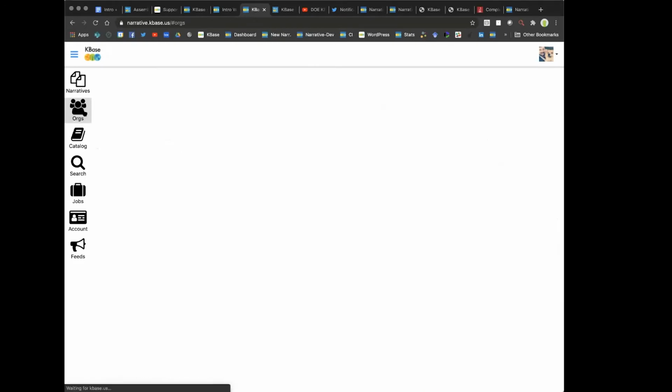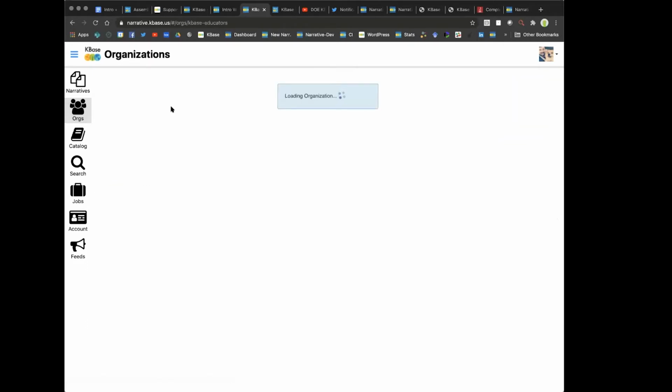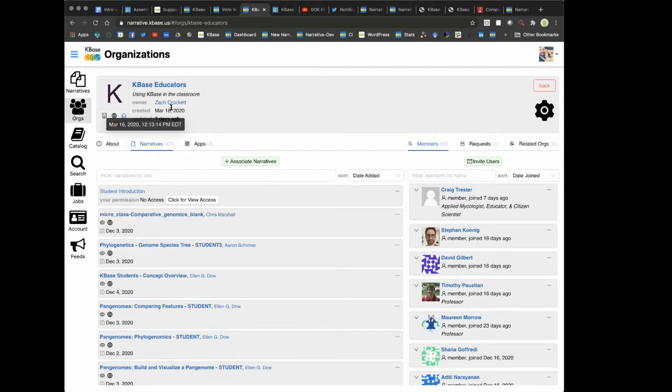I will just show you some other public orgs that are useful. So the KBase educators org, there's a group of people that are using KBase to train their students on bioinformatics.